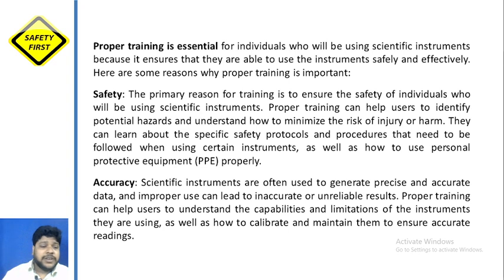Now, one thing: while talking about the hazards, I said that training is very important. The training could be helpful in ensuring that we have minimized the risk posed by hazards, and there are some other important benefits of proper training. In these slides, I will be talking about the factors which can improve if we provide proper training for individuals using scientific instruments. It ensures that they are able to use the instrument. It is good for the instrument as well as the user.